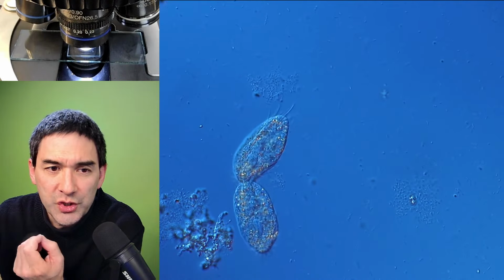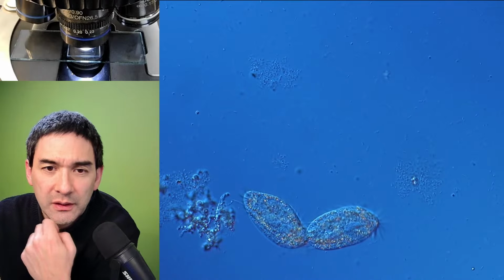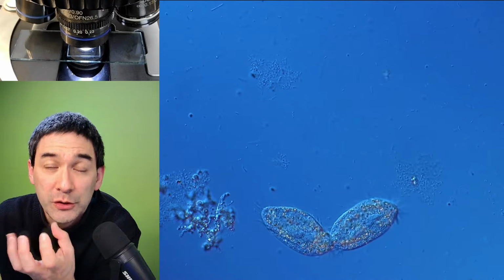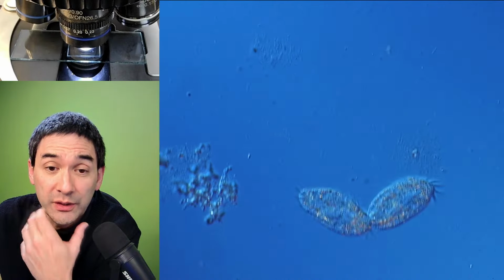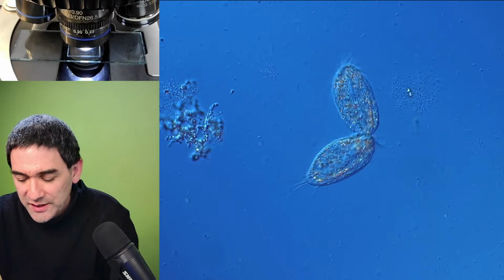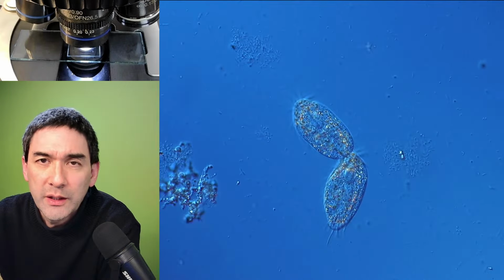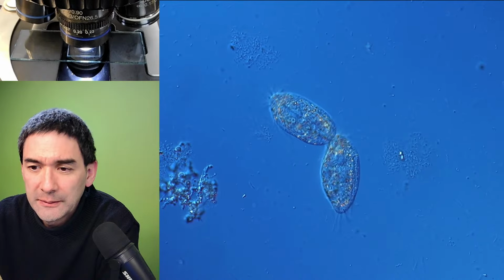With a crushed cereal grain, everything is a little bit more concentrated around the cereal, and the liquid around it also looks much more clear and not quite as cloudy. So that's why I want to see how well this actually works this time with the crushed cereal grain. Usually, you have to wait around 3 days or so.